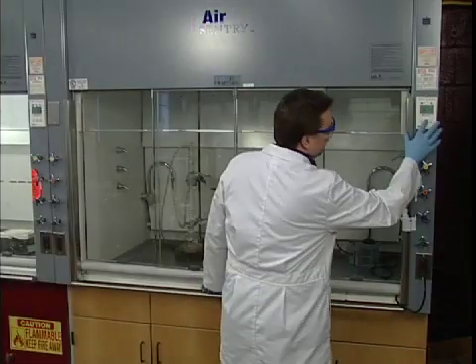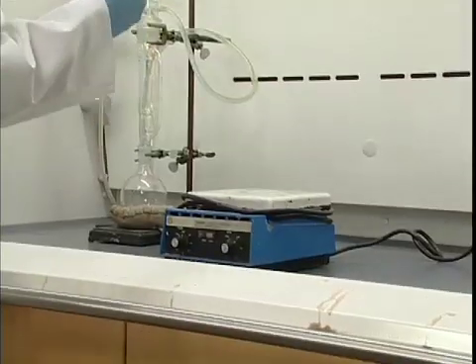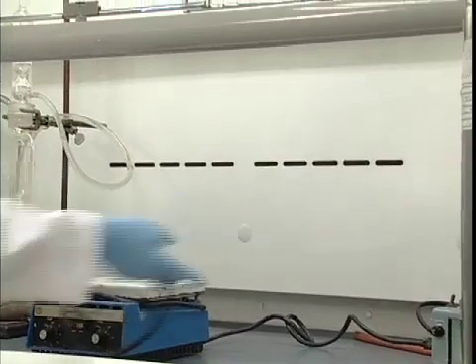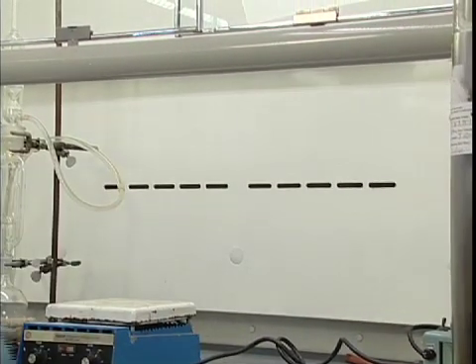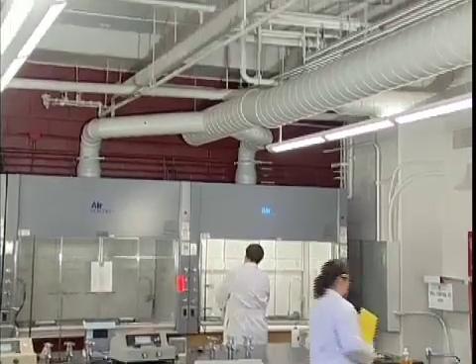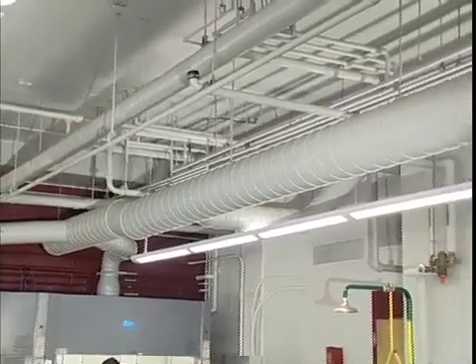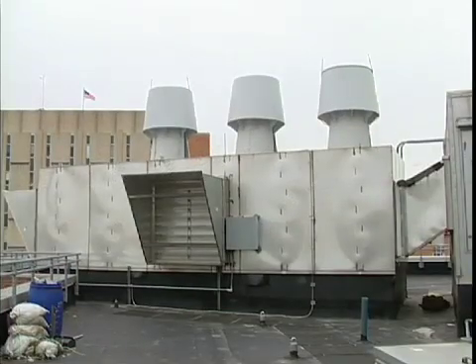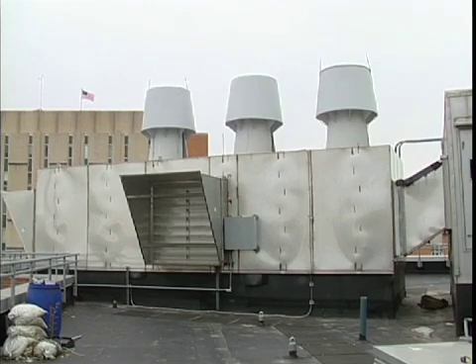Exhaust hoods protect us by preventing contaminants within the hood from entering our breathing zone. A protective barrier is created by air that's pulled into and through the hood. This inward airflow helps keep hazardous fumes and vapors from escaping and reaching anyone outside the hood. Contaminants that are captured within the airflow are filtered, diluted and exhausted through the hood's duct system. This air is then sent outside the building where the contaminants are further diluted into the atmosphere.